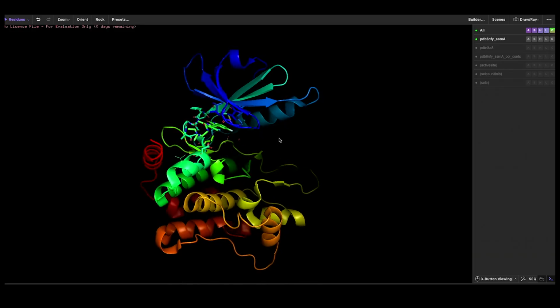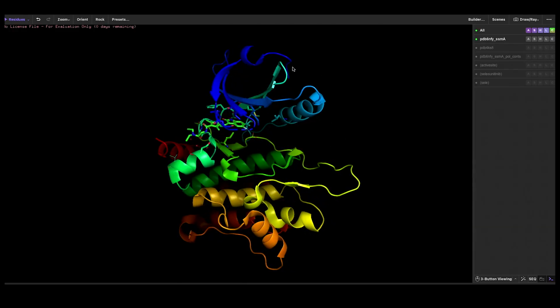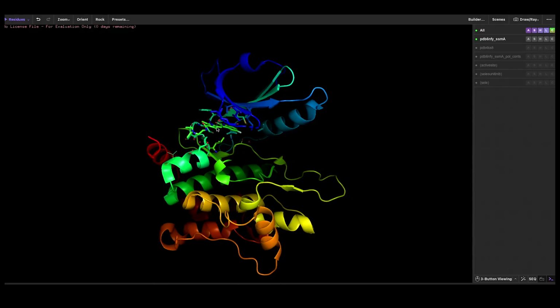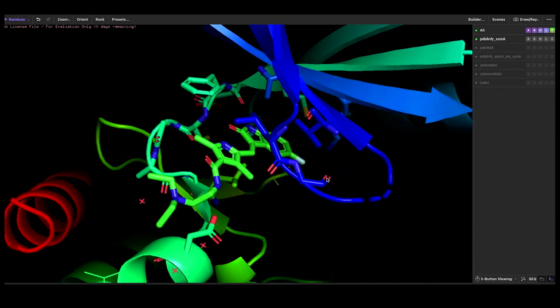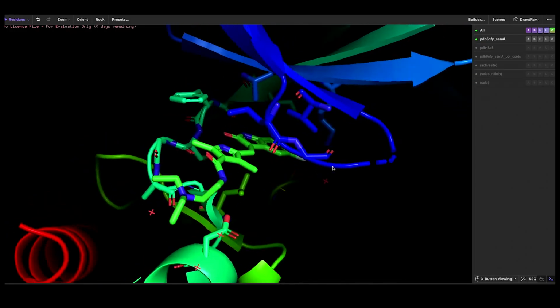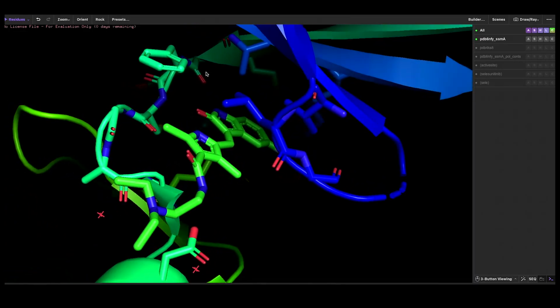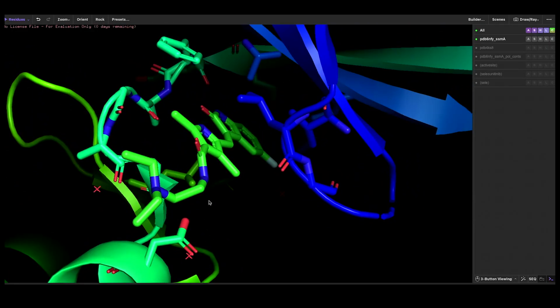So here's the same kinase colored the same way in this rainbow representation, again cartoon, from blue, the N terminus, down to red, which is the C terminus. And here is the binding site for this compound that is called sunitinib. We can zoom in there, and then here you can see more of the depth when I scroll away information. You can see more details. And here now some of the amino acids I have made into the stick representation, so you can see them more clearly. The other amino acids are now hidden.